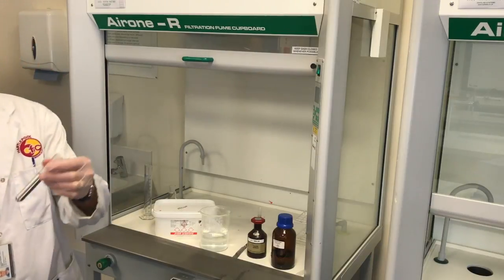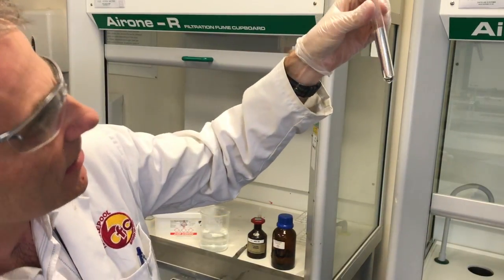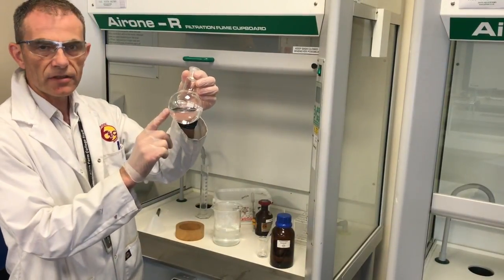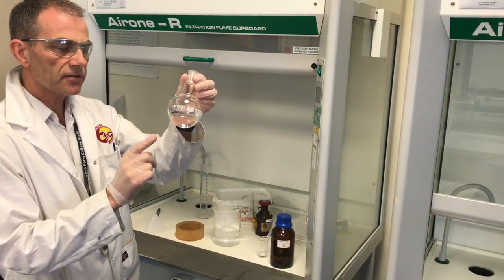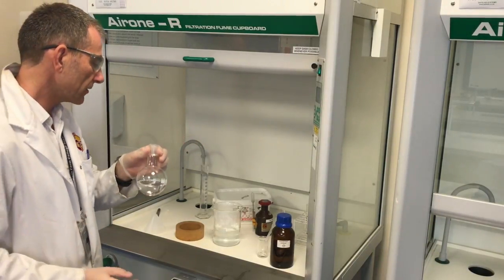That's brilliant. I love it. That's great. OK, so time for the flask. I've got 100 centimetres cubed of silver nitrate in there, so I'm scaling it up 20-fold.